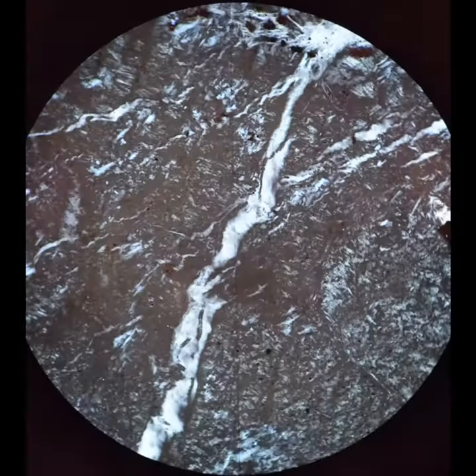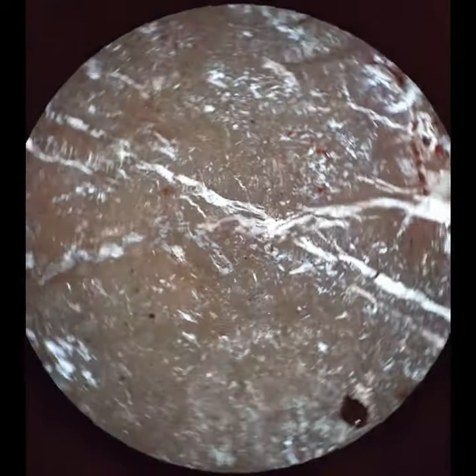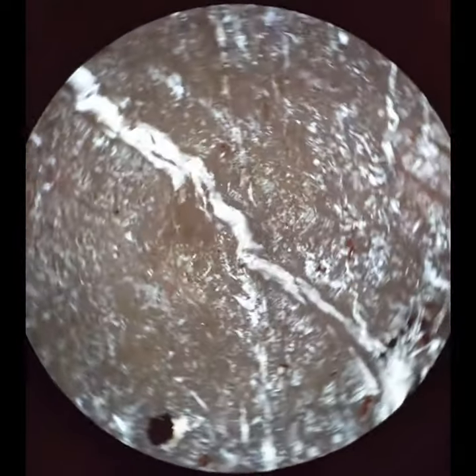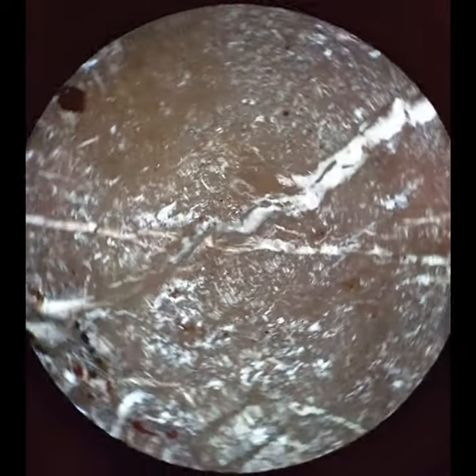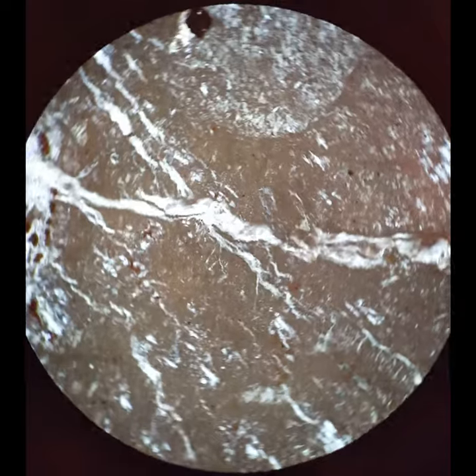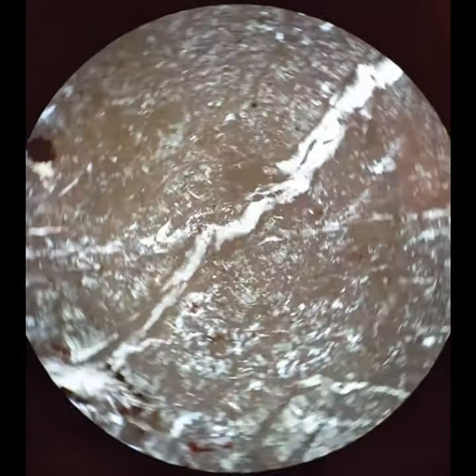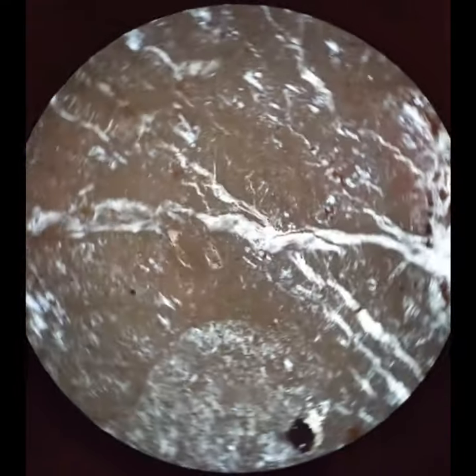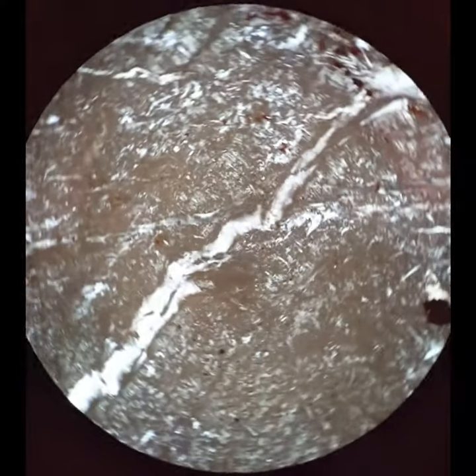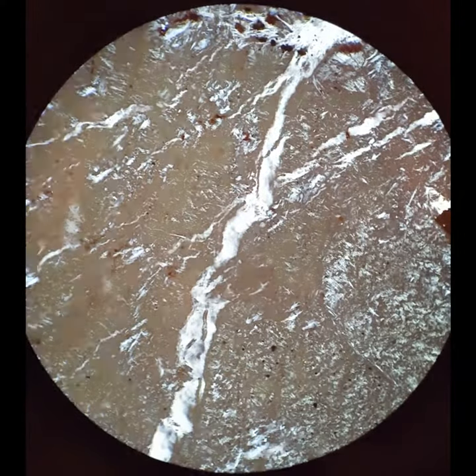When you cross the polars, it has these low first-order interference colors. There's a vein of serpentine running across that field of view, and you can see it's black and white and gray, and that's about it.